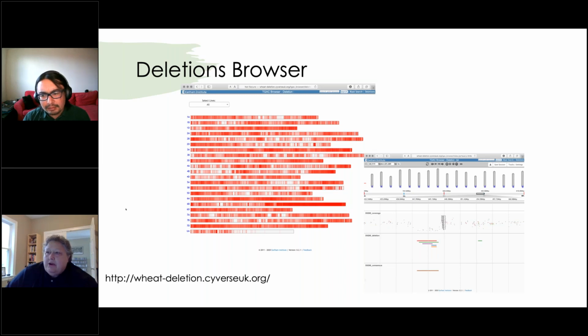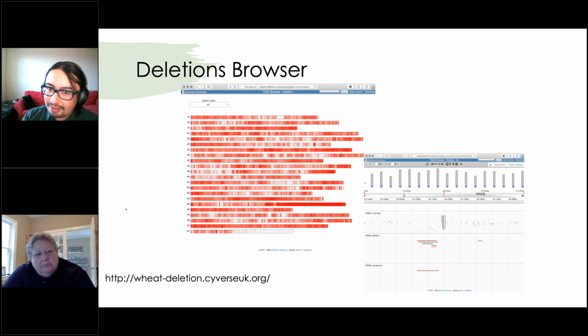Okay. Does PolyMarker have a function to help design homoeolog specific primers optimized for RT-qPCR? So yes and no. It's a bit technical. PolyMarker will search for the positions that you can use to be homoeolog specific or specific to the genome that you want to use. But since that's not a technology that I have personal experience with, I don't have a setup of what to give to Primer3 to validate the dataset. However, you can give to PolyMarker a preference file of Primer3, and it will force Primer3 to use those parameters if you know how to set it up for certain technology.